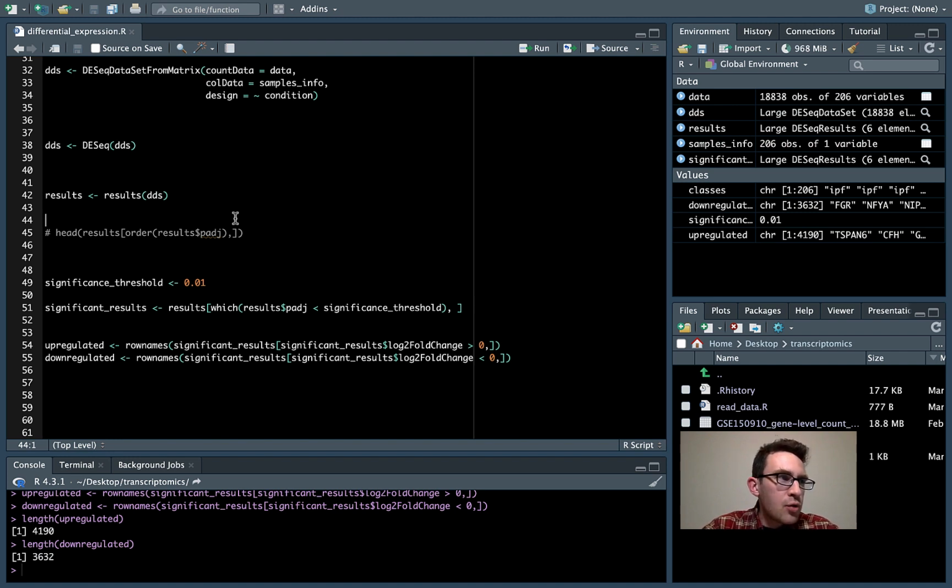Because the idea is really to see what differential expression is due to the IPF disease. So if you were doing this for a real project, you may want to control for other variables that could be affecting the difference between the subject groups. But this is just a kind of informal tutorial video, so I didn't do that in this video. But if you're going to publish a paper on this, you may want to do additional controls like that.